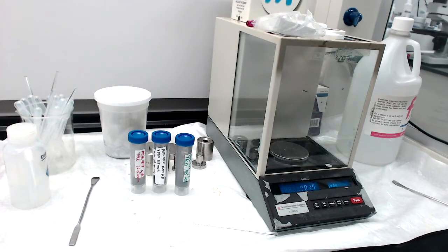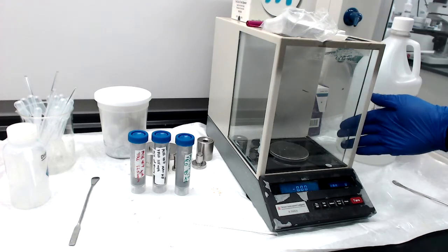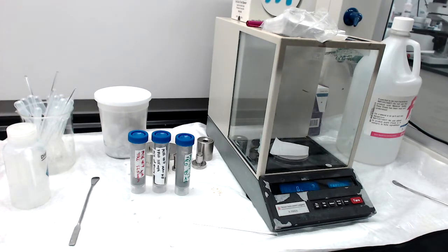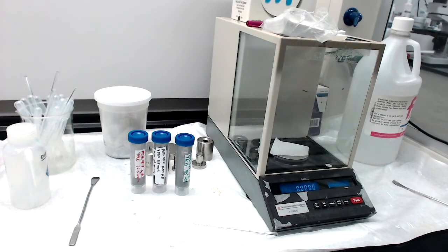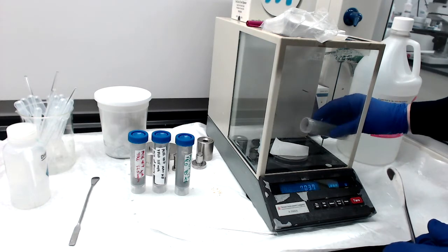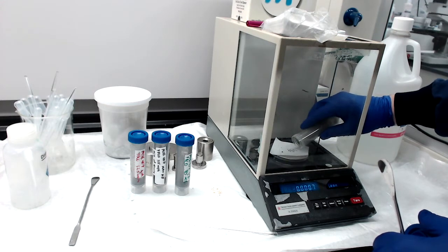The first step is to weigh out the YBCO powder. This is sintered and has gone through a 325 mesh sieve. I'm going to put a weigh paper on the scale, close it back up, and tare the balance. I'm targeting 50 milligrams, which would be 0.05 grams. I don't have to be exactly 0.05 — I just have to know exactly how much I have.